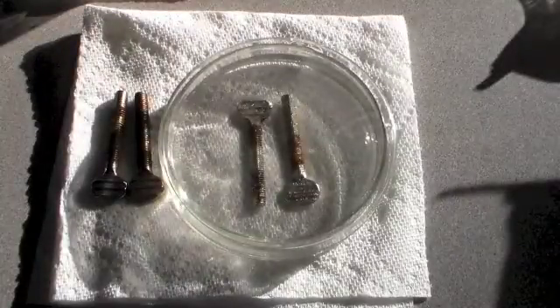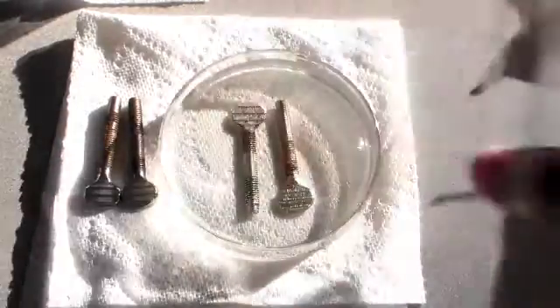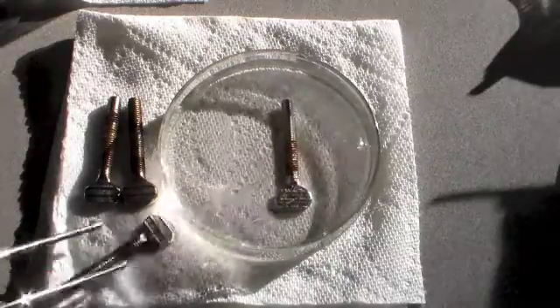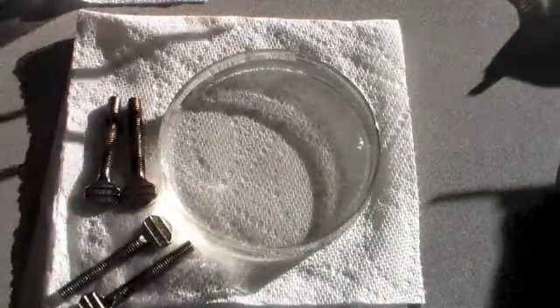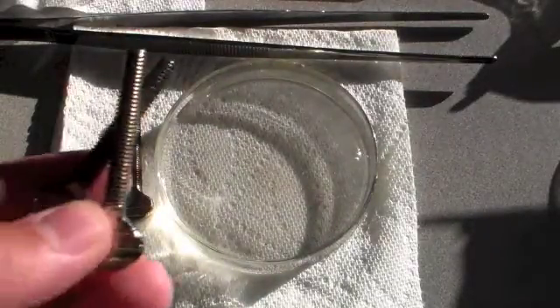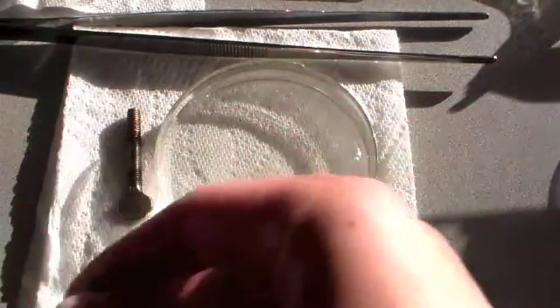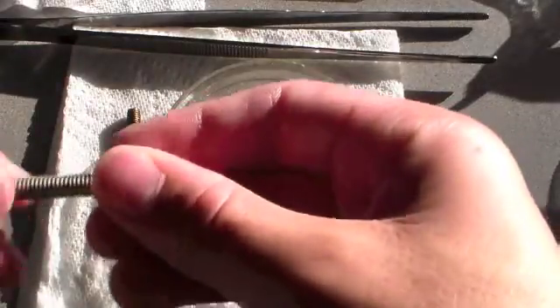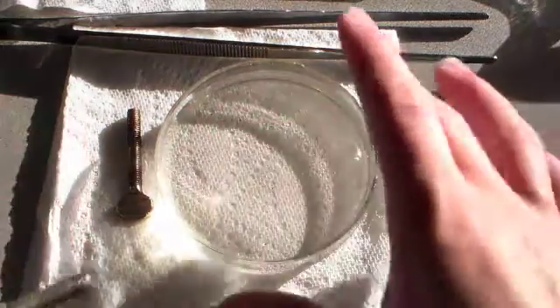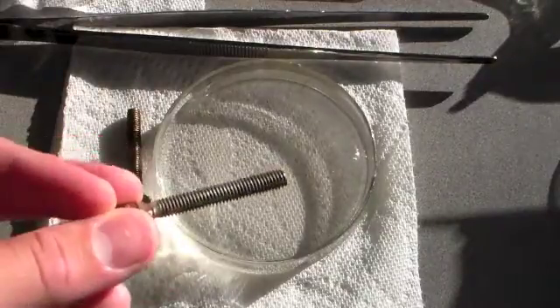So the screws have been sitting in the vinegar and salt solution for about 12 hours now. I'm going to remove them and take them over to the sink and wash them off. After quite a bit of scrubbing, I've managed to remove pretty much all of the rust from both of the screws. They're a lot cleaner now. So it looks like this method won't just dissolve all the rust and leave you with a clean nail, but it makes the rust easier to scrub off.